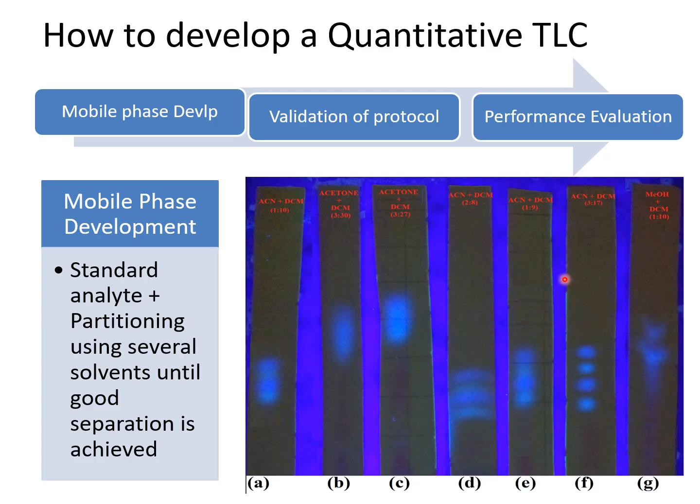Now looking at the plate, the best solvent system that produces a good separation of the aflatoxin is the solvent system used in lane F. Looking at it, the aflatoxins were well separated, although lane D and lane E also produce a kind of separation of the aflatoxins, but the solvent system used in lane F has a very good polarity that produces better separation of the aflatoxins.